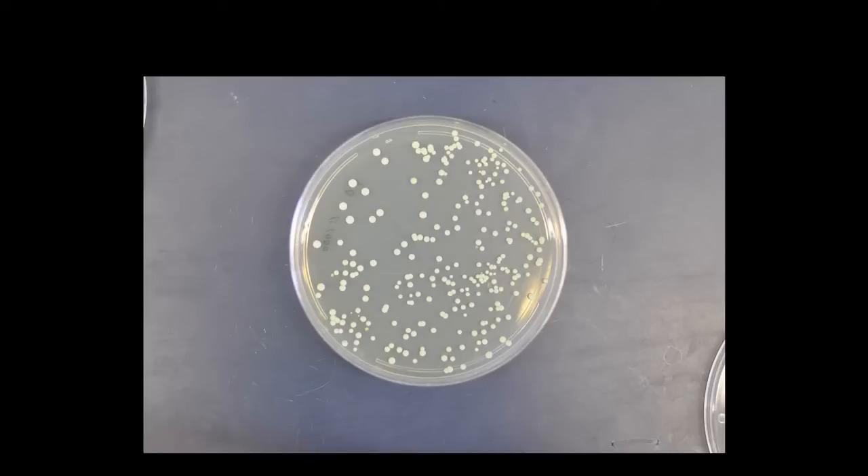The Bullet Blender can also be used for special applications such as the extraction of viable cells from samples. For a list of protocols and applications, please see our website, www.nextadvance.com.